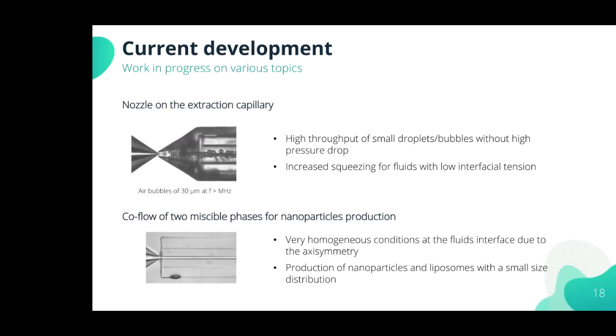What kind of UV lamps do you use to polymerize the particles? In this case, it was LED, yes. Less in the UVB. And the dose I didn't remember. I can send you an email if you want more precise. But it's a fine tuning. It will depend on the resin, the quantity, the amount of photo initiator.